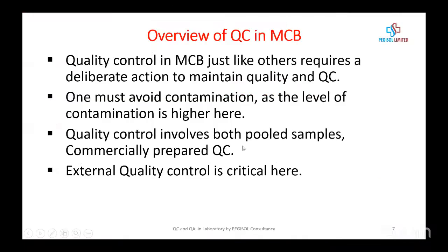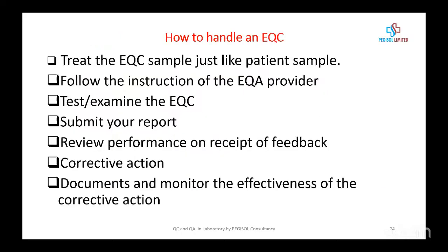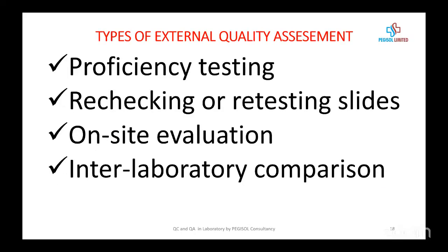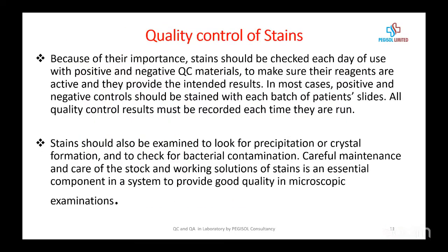So next we look at an overview of QC in the microbiology lab. Now, this is very, very important for us. So I will stop at QC in the microbiology lab for today.